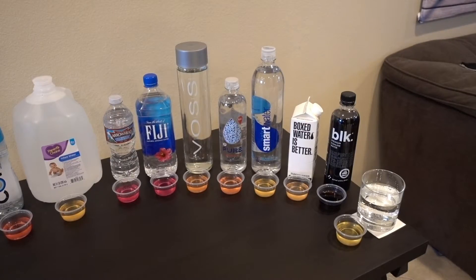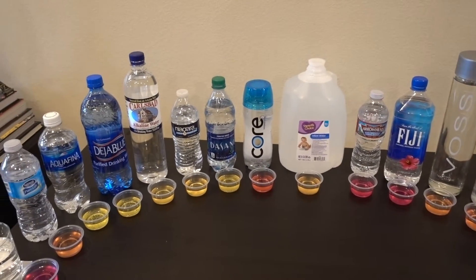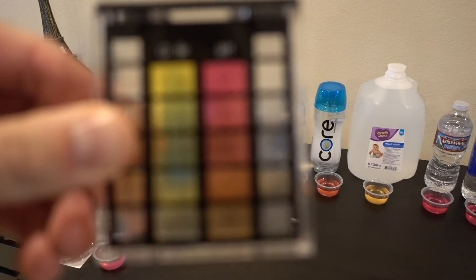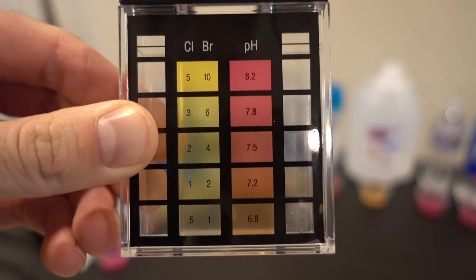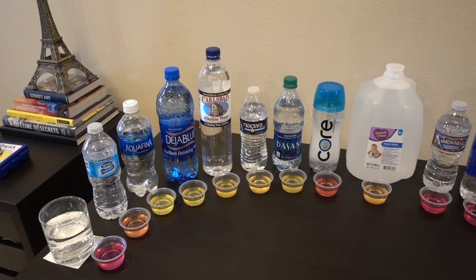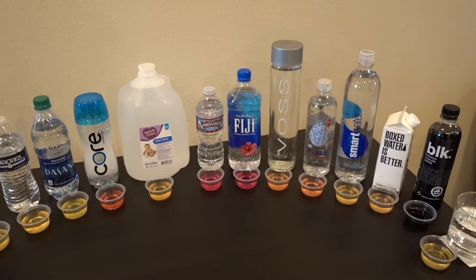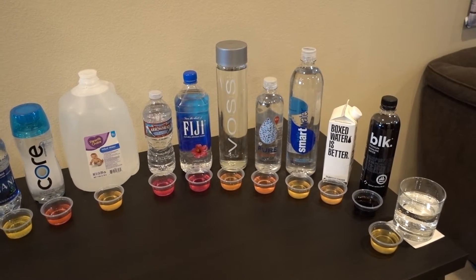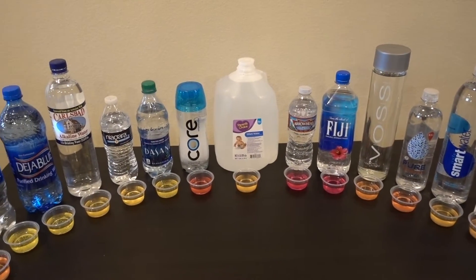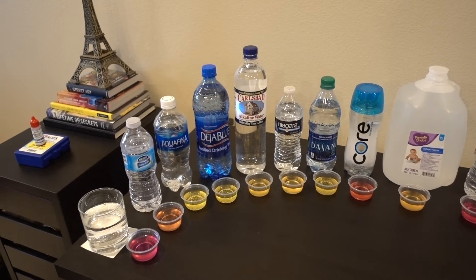All the drops are in, and here are the results. This scale goes from 6.8 to 8.2 — for those of you that don't know, the pH scale actually goes from 0 to 14, so this at least gives us a good idea of whether it is acidic, alkaline, or neutral. The more red it is, the more alkaline it's going to be; the more yellow it is, the more acidic; and the ones that are orange are pretty much neutral.